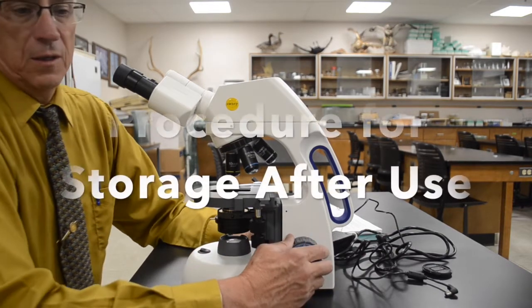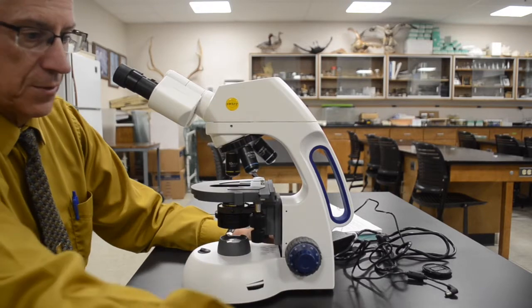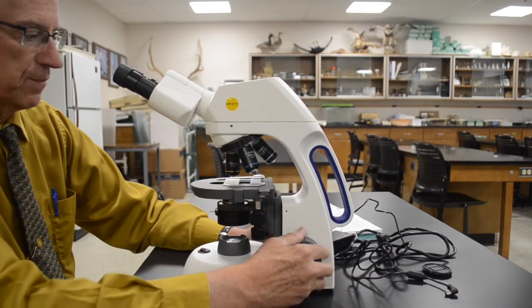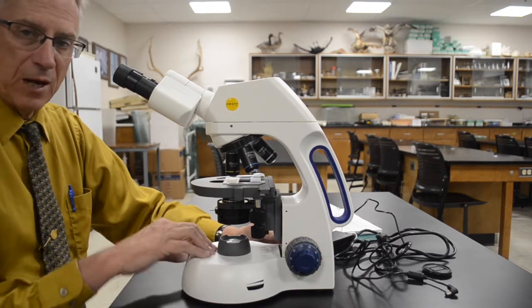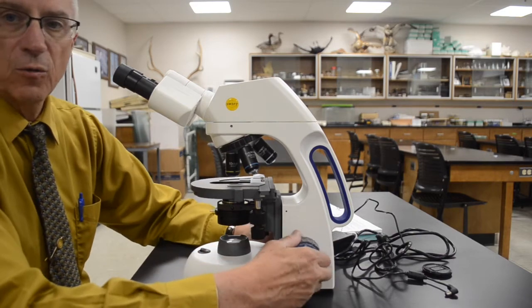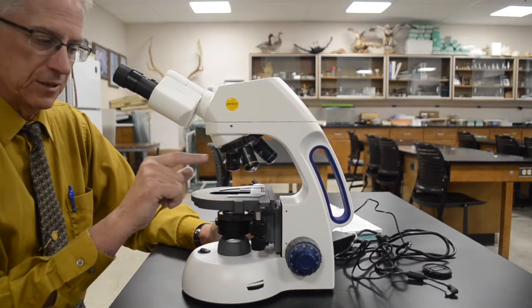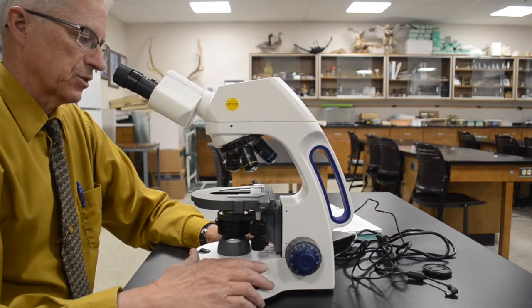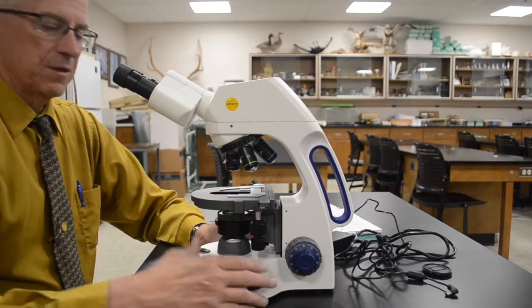Let me show you how to prepare a microscope for putting it away. Let's say somebody's been using the microscope — there is a slide on the stage and they've had it at some magnification, in this case at 10 power. The first thing you do is turn the power off, remove the slide, and set it aside. Then lower the stage to its lowest level, put the lowest power objective lens in place because it's the shortest, and gently wrap the power cord around the base and arm. Then you can pick it up and put it away.